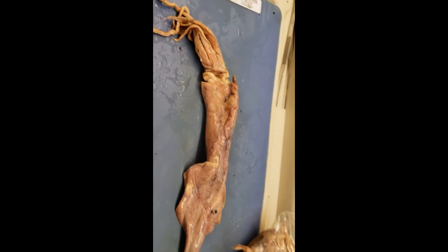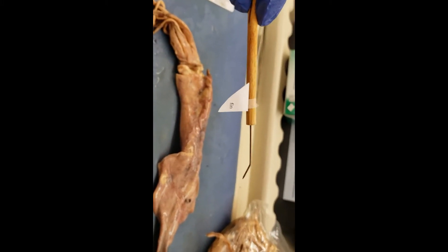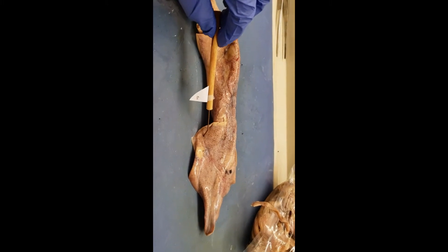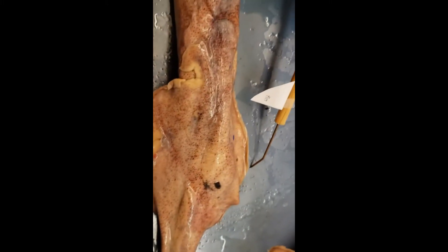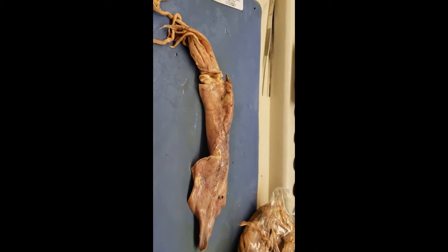Let's look at the first external structure: the fin. A fin is used for movement — it helps in movement, and it's found right there. There's one on this side, and if you come along with me, there's one there too. Two fins for the squid.